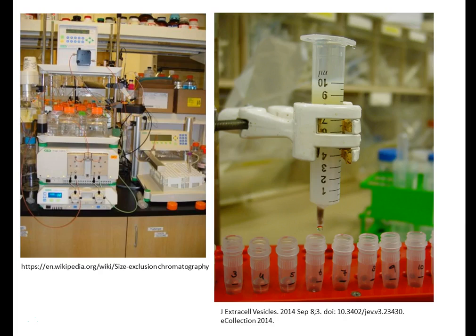Now on the right you see what we did in the AMC. We took a simple 10 ml syringe, put in some nylon stocking at the bottom so that the gel which you pour in does not come out. The gel consists of Sepharose 2B, and this system you can use to put on plasma or other body fluids or other fluids containing vesicles, and you can isolate and purify the vesicles and separate them from the proteins.